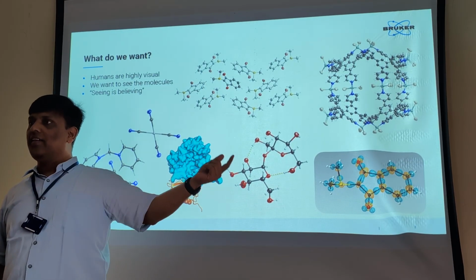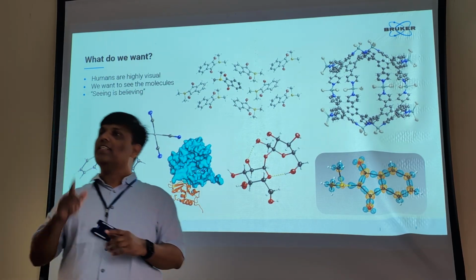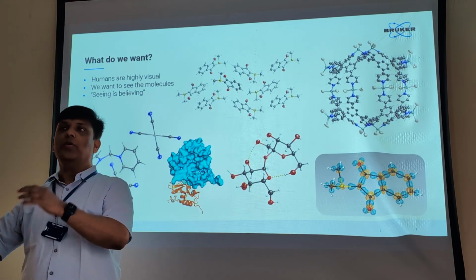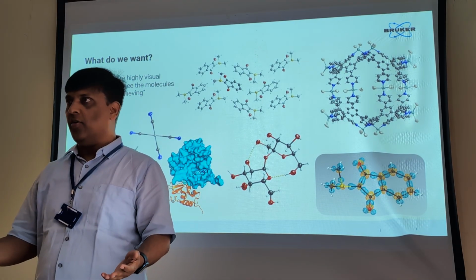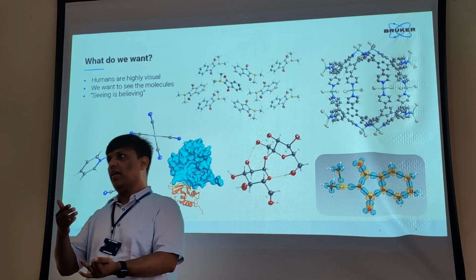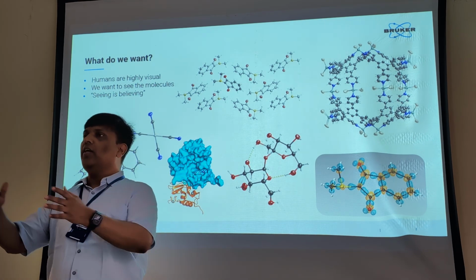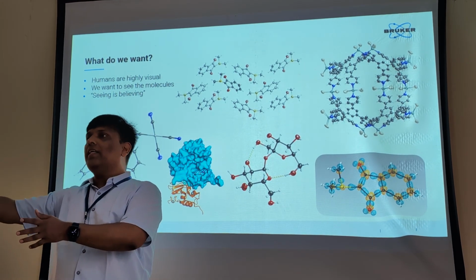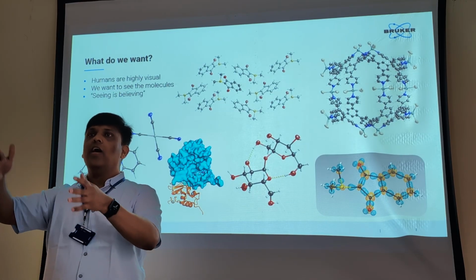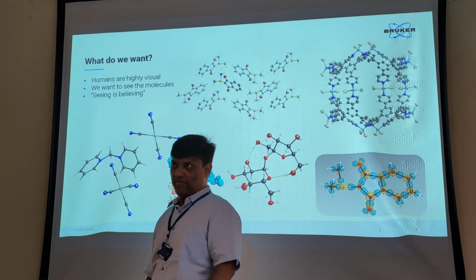But there is one additional piece of information: single crystal. The single crystal is the sample which you are going to analyze. In an X-ray diffractometer, you can put anything to get diffraction: polycrystalline material, thin films, powders, rubbers, polymers, whatever, and you will get diffraction. But that is an average diffraction. You will get intensity versus 2 theta: what is there, how much is there. But you will not be able to establish structures like this.